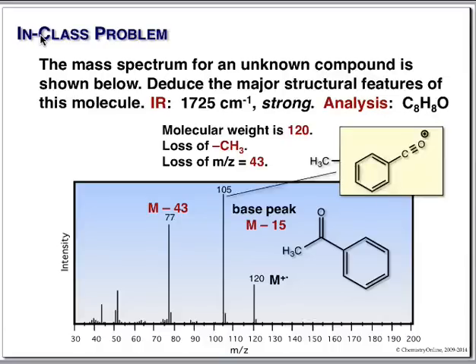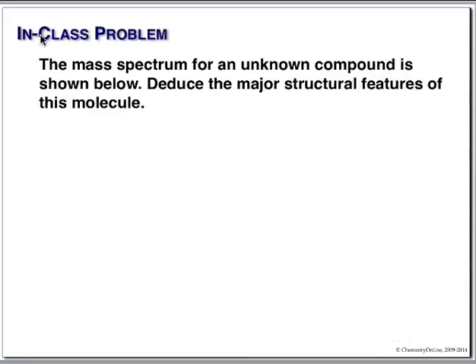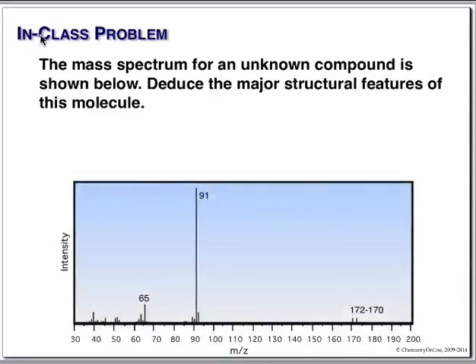This peak here, where we lost 15, once again, this is our oxonium ion. Cleave this off, very stable carbocation. Both of these down here, 172 and 170, both of those are molecular ions. Our base peak here is 91. Oh my gosh, what's that? That's going to be our tropylium ion, isn't it? And if you take the average here and subtract 91 from it, you get 80. So this is an M-80.